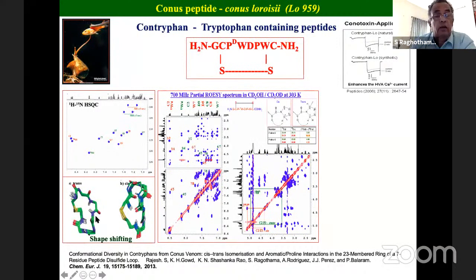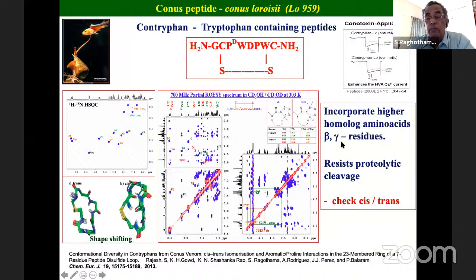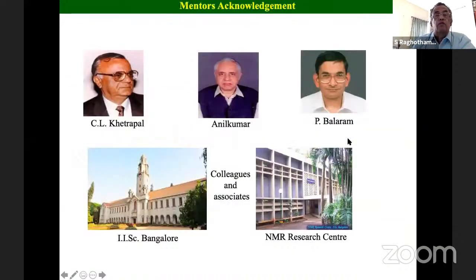They can bind to two different receptors. So there's one efficient way of doing it, and we could publish this way back in. So this is how NMR is used to get these structures. So one can develop it further, and I'm not going to those details here. Now with that, I've come to the end of my lecture.